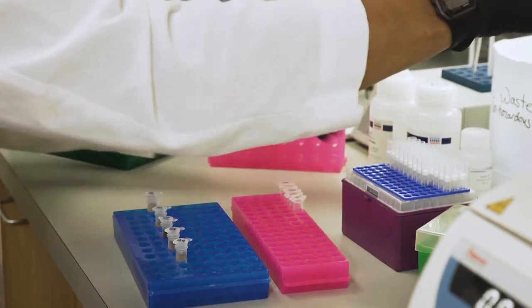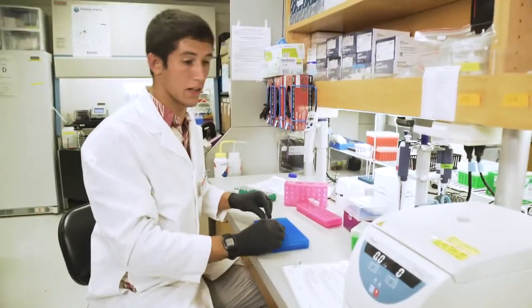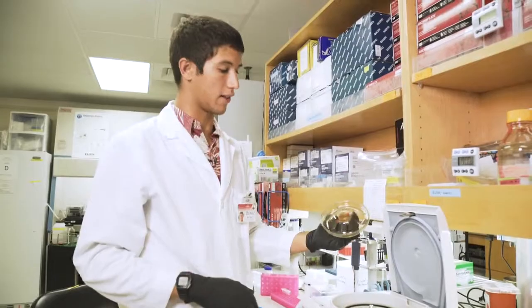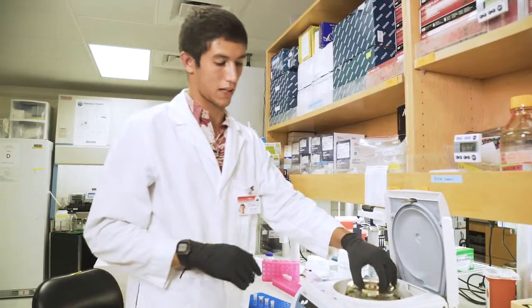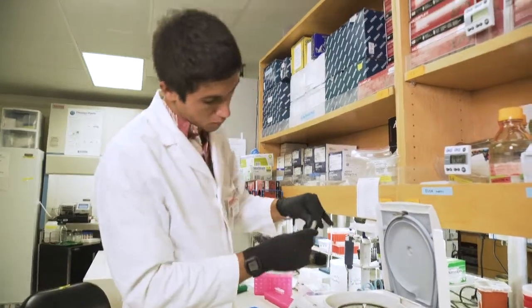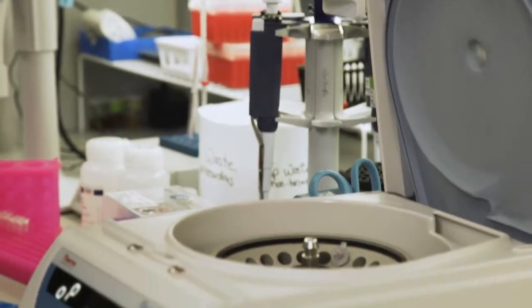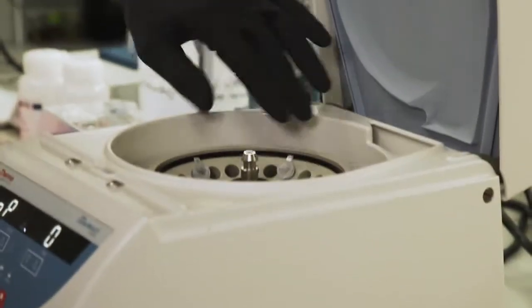All right, so that's done. Those are lids. Those tubes are done. Now we load them into the centrifuge. So there's the lid, just in case anything does go flying, it hits the lid and not anything else. So pull the lid off, and we load our tubes into the wells. And the important thing to do when loading a centrifuge is to evenly space apart all the tubes.